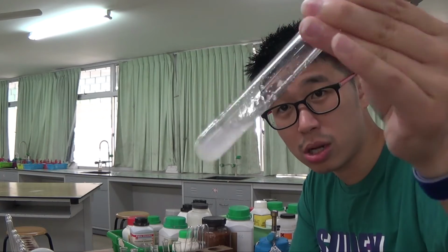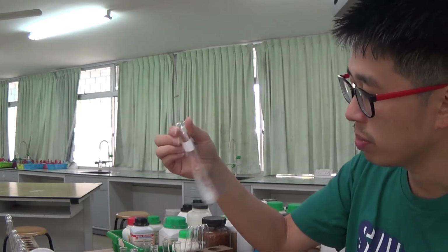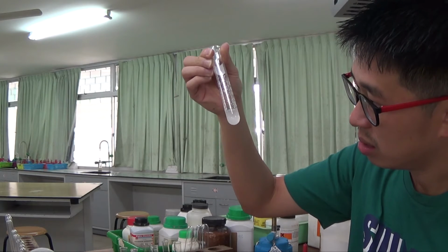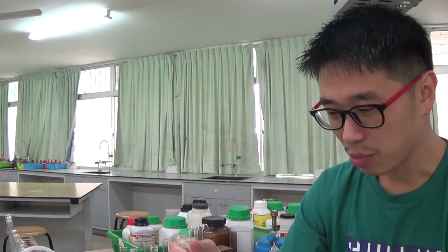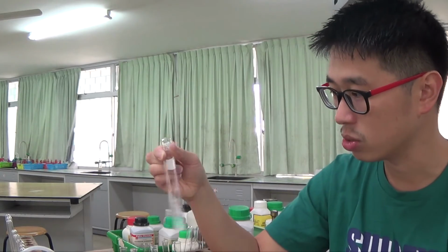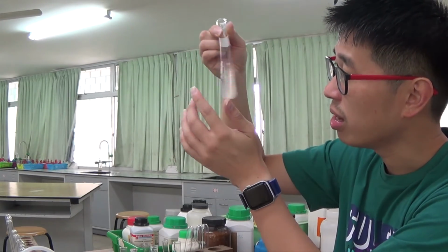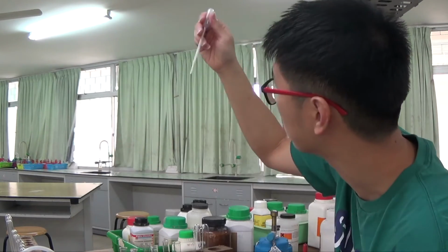So this thing now is not very soluble in water. So I've just dissolved more of the ammonium aluminium sulfate in water. Okay, because I want to try and show you, they're supposed to precipitate out with sodium hydroxide, but just now it was not clear at all. So my suspicion is that my solution was not very concentrated, and that's why it's very difficult to see the precipitate. So I'll let the solid settle down, and then I will take out a little bit of it for my test. Just use a clean dropping pipette.